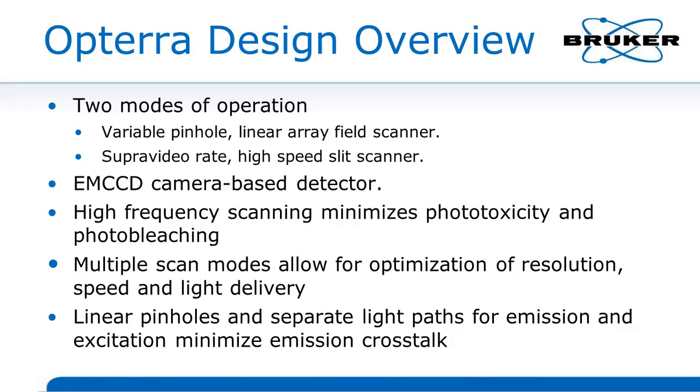And it's especially challenging with multidimensional experiments where people are typically acquiring Z-series over time. I think a lot of you know that even though with a confocal system you're focused on a particular focal plane, there's still constant illumination above and, to some degree, below that focal plane, which just contributes to the photobleaching of the overall sample.